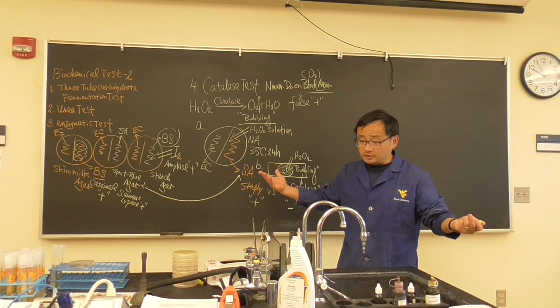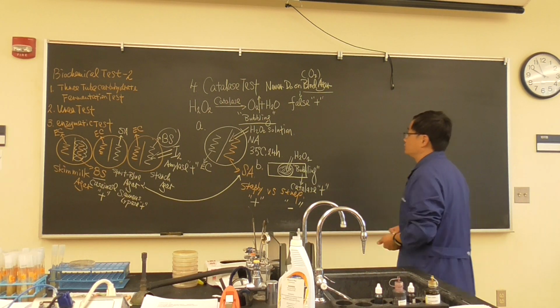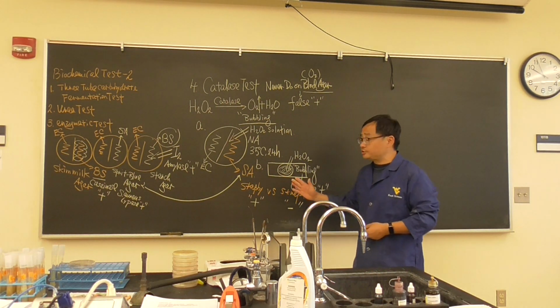But it can fail. It can give you a false positive impression. Okay, so that's the catalase test. So today's work is easy.